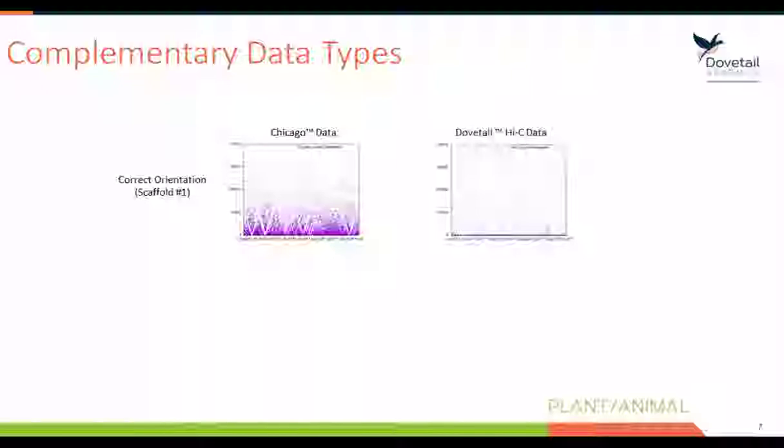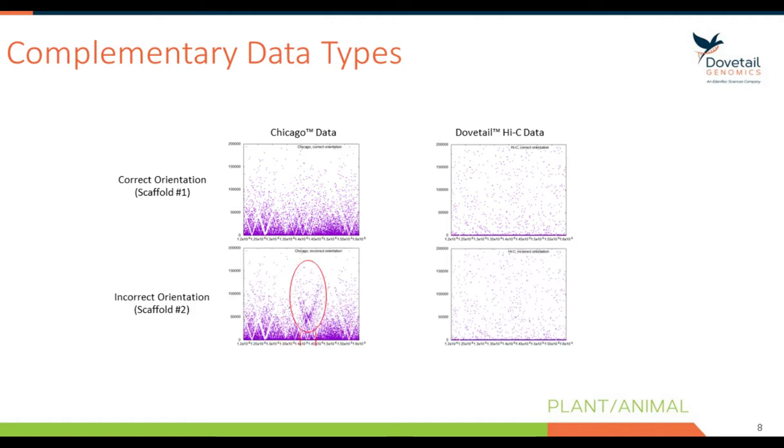This makes sense because with Hi-C, we're trying to scaffold entire chromosomes, whereas with Chicago, we're only having to assemble molecules of 100 or 150 kb. So this data density difference makes a lot of sense. What we then did is we introduced a false misjoin into the input assembly and then tried to scaffold that with Chicago and Hi-C. The misjoin is actually an inversion event that we purposely created, and it's shown in red here.